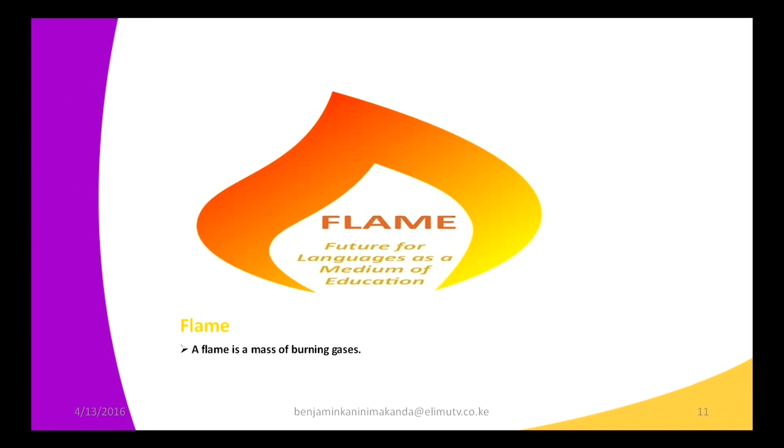Mass of burning gases, meaning that the gases that are burning are in large quantities, but these ones are mixtures. So when you burn large quantities of gases, they give you a product called a flame. So going to our Bunsen burner, if you mix laboratory gas and air, then they form a mass of burning gases. When this mass is burned, it produces this kind of flame. So a flame is defined as a mass of burning gases, meaning that when the gases are burnt, they produce flame.